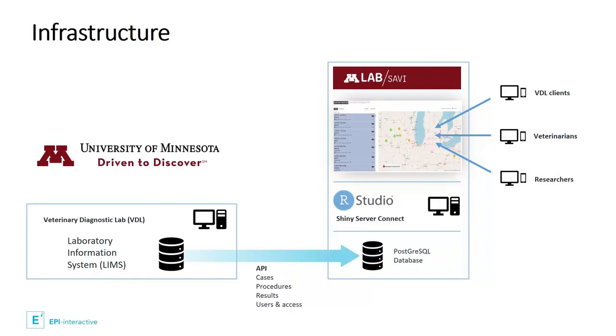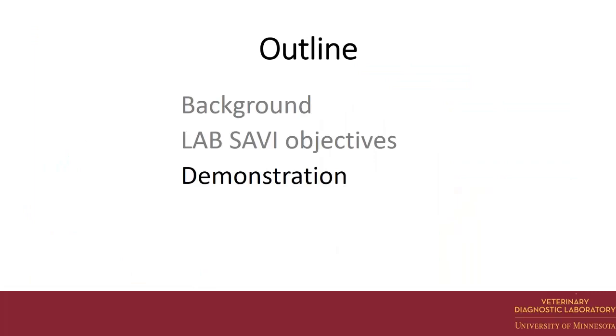And so here's all the cool stuff about it. It's written in the program R, which is an open access program, so that we can build onto it relatively easily. The graphical interface, the illustration, the visualization is through RStudio, which again is intended to not require a lot of manipulation on the part of the user. Just plug in what it is that you want to look at, and it'll pop it up. And so that's the foundation, the infrastructure of how it's built.